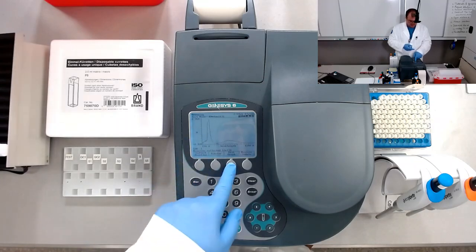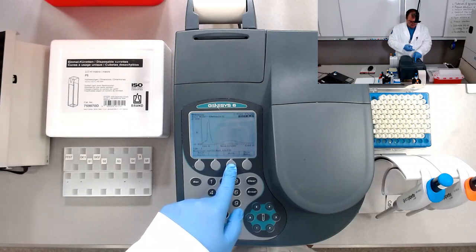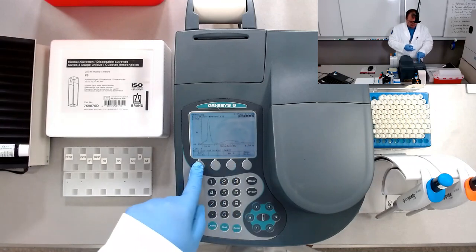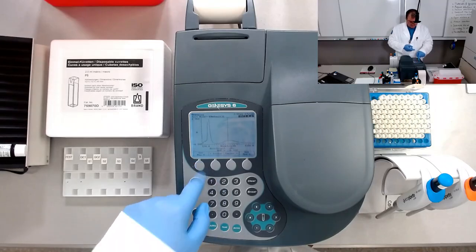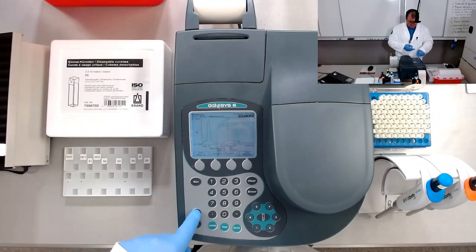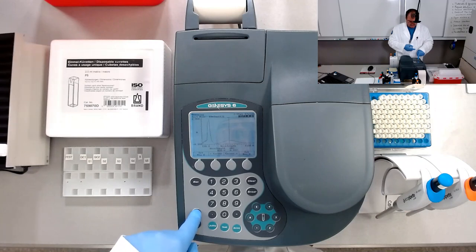Okay, so if we go into the graph, we can use the cursor. If we move the cursor, we see 655, 334, 333, 337.